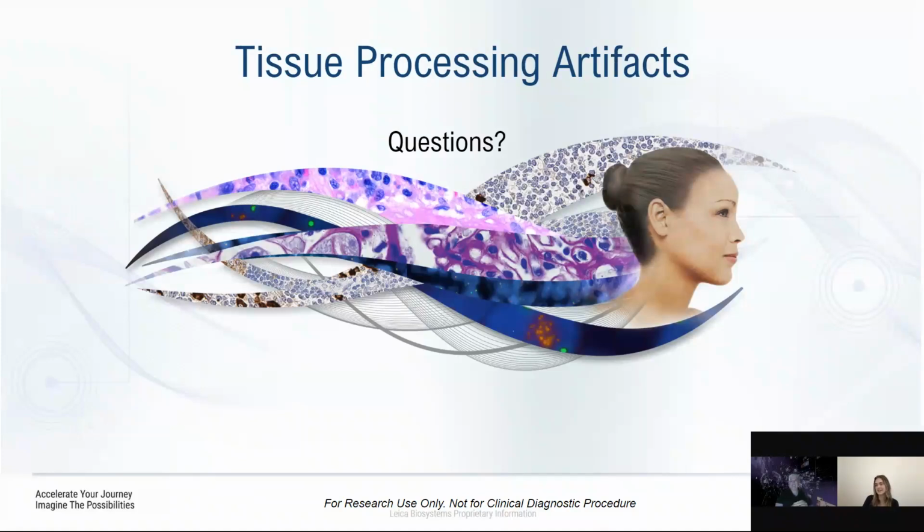Now, if the xylene is heated for permeability purposes, is that a norm or is this a unique practice? So I've been in histology for several decades, and it does seem like heat has been, along with pressure and vacuum on processors, what I call the necessary evils of tissue processing. But now that we're in an age of doing not only IHC for the last 40 or 50 years in the laboratory, but now moving into in situ hybridization, where we are targeting RNA, it is even more critical to have a fresh look at how we tissue process.